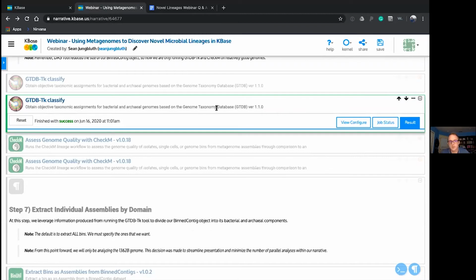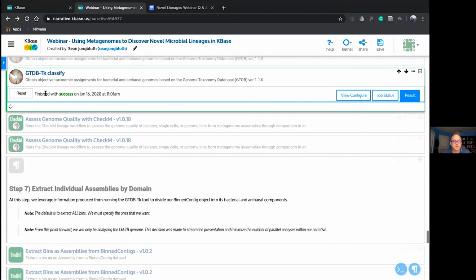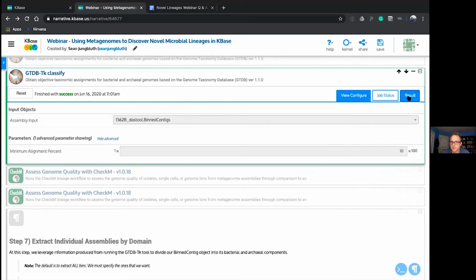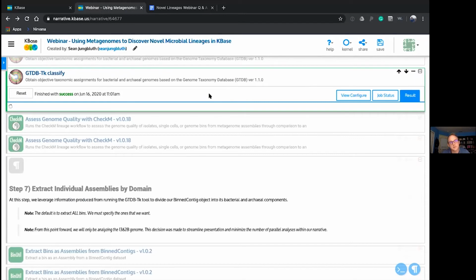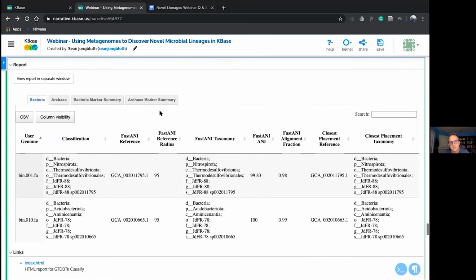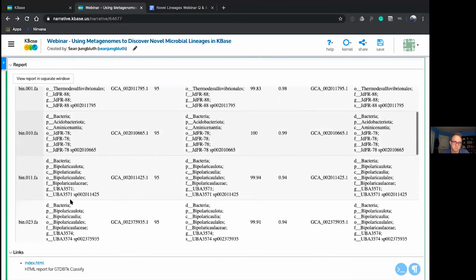Well, we're doing good on time. I think I'll just give a quick hat tip here to the results from sample B, which was run in the same way. And because these two samples were collected from the same-ish environment, ideally we would see mostly similar taxa here. And indeed, that is what we see.